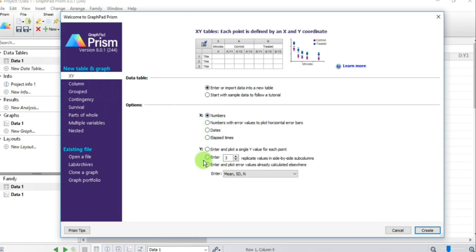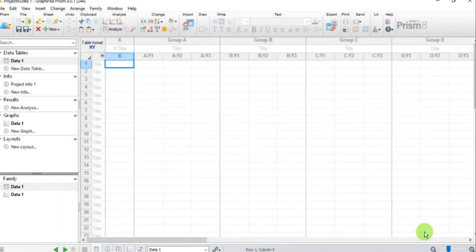For the Y values, since our data is in triplicate, select that option. If we had duplicate data we would reduce the number to 2. Set it to 3 and press Create.